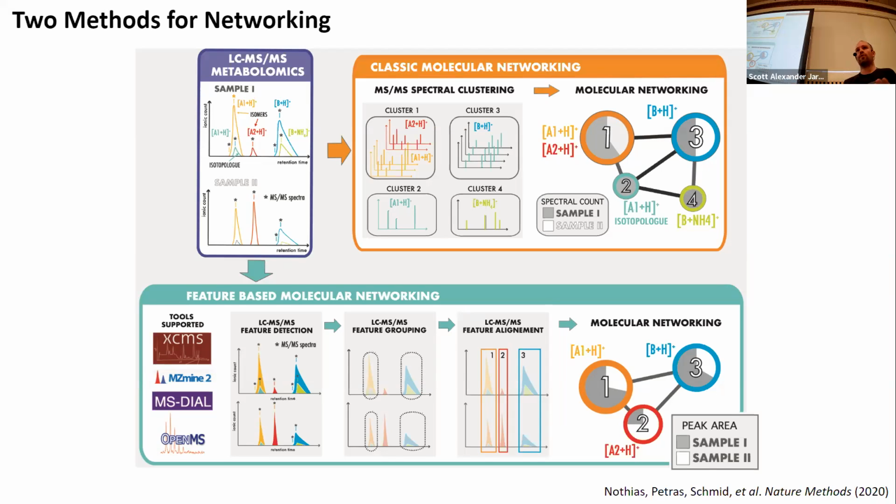Because there you don't have to worry about any pre-processing, you just dump your mzML files into GNPS, and it creates a simplified molecular network only on MS2 level. But again, you first of all want to get the analysis done, right? And if you struggle with the settings and can't manage to go all the way through, then go back to classic molecular networking.